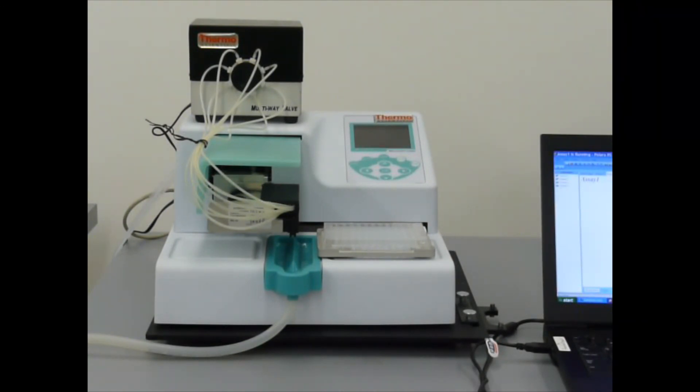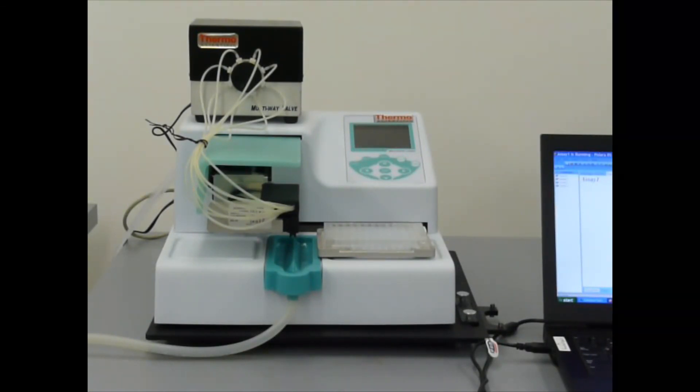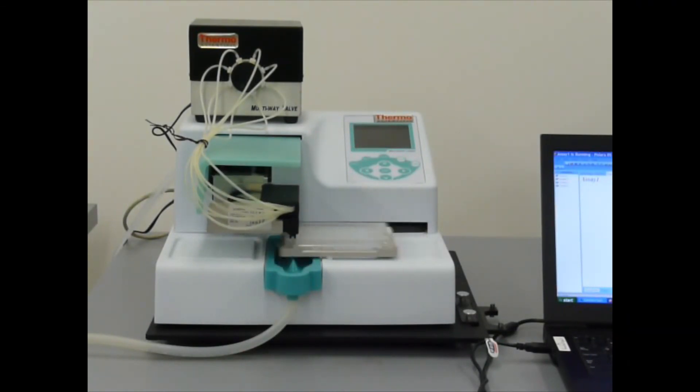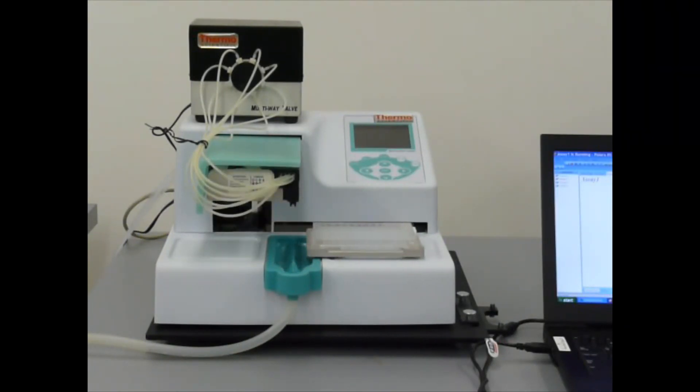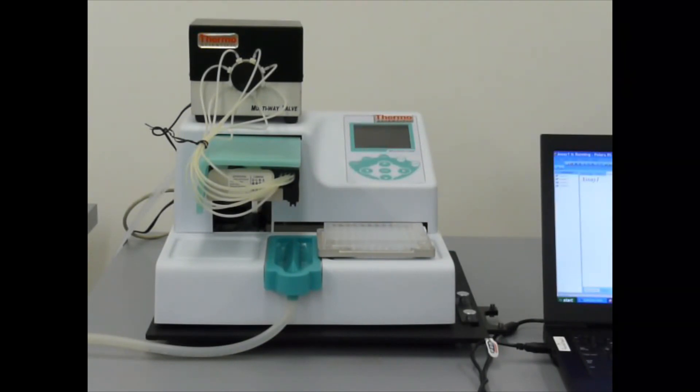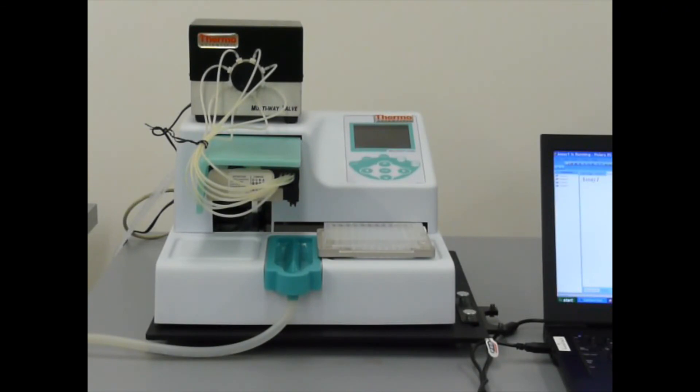Now it's priming with reagent two, and it'll dispense reagent two into the odd columns. Because I've queued two plates, it's going to do this one more time. But it's going to wait in robot time. It thinks the rapid stack is taking the plate and then loading another plate.